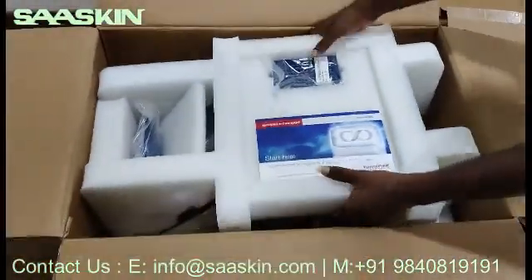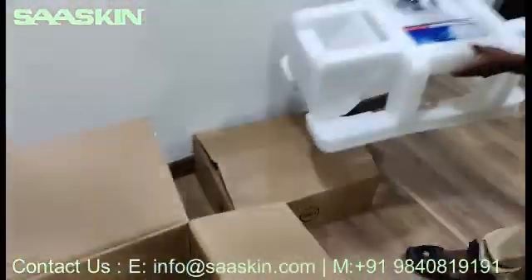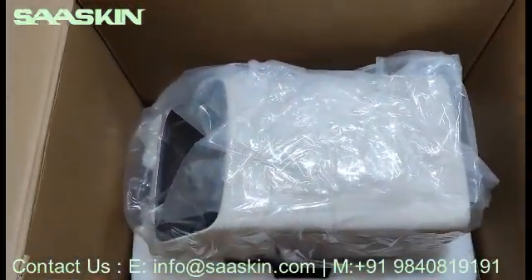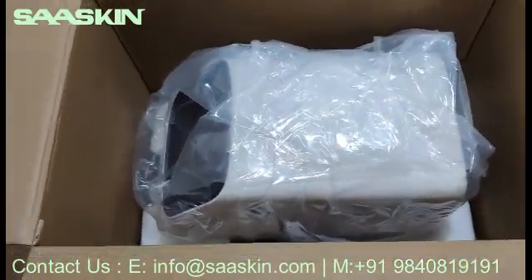Let me just open this for you. This is how the top looks. It's well packed and has come with very strong support. You don't need to worry that the instrument will get damaged during transport — the way it is packed is very well packed.